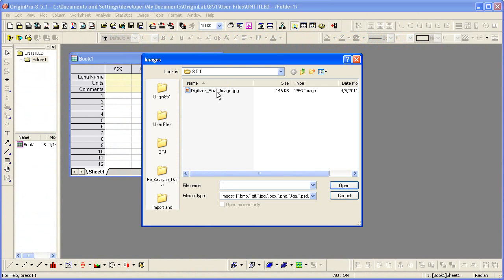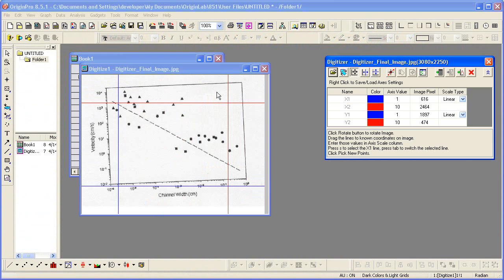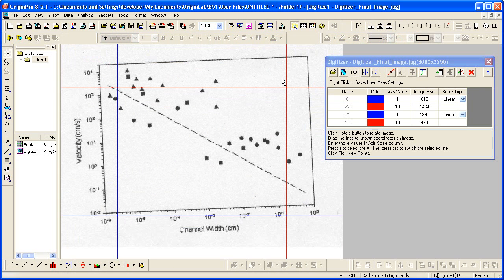Browse to select your image file. The image is opened onto an Origin graph and the Digitizer dialog is opened.